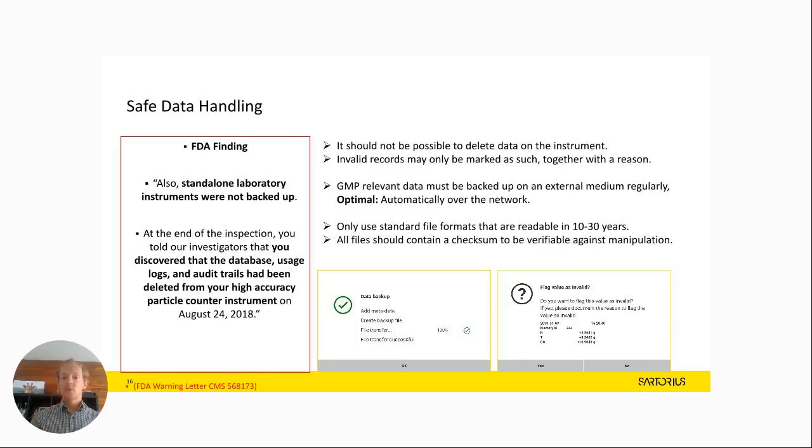Besides that, you can set up your individual backup. I always recommend for more advanced applications that you have a backup for audit trail, alibi memory, all of your data, because it could be that you need it again in 5 or 10 or 15 years. For example, Japan requires 30 years of data. And with, for example, this instrument, you set up the backup how you want through the connection which you want, and you set it up in the time you want. It can be twice a day, one time a day, that is up to you. But we recommend just having an update.